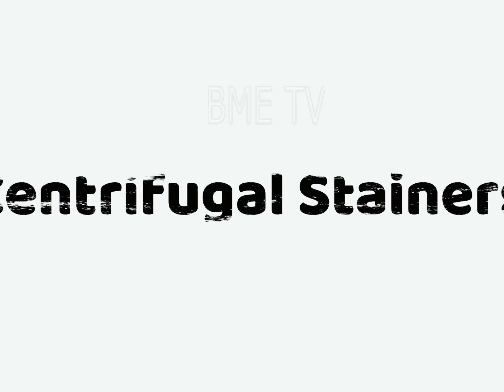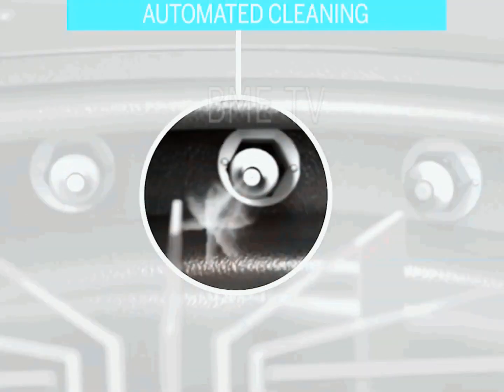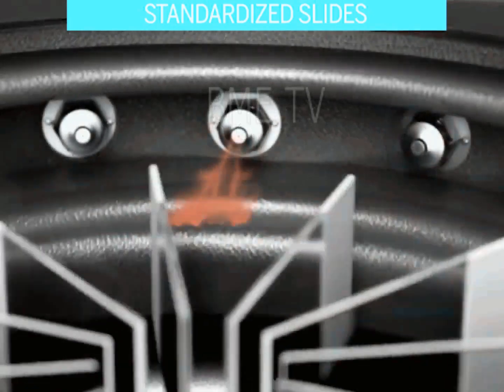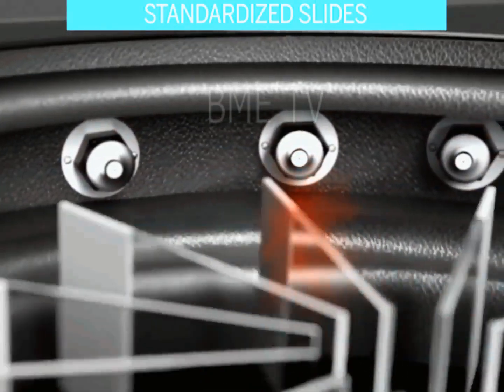The second type is a centrifugal stainer. Centrifugal stainers spray stain onto the specimen as the slides rotate past spray nozzles in a spinning chamber. Common applications of this technology are PAP, Gram, acid-fast, and hematology staining. The pre-packaged reagents are in closed containers with pump tubing. This eliminates evaporation and contamination of reagents.